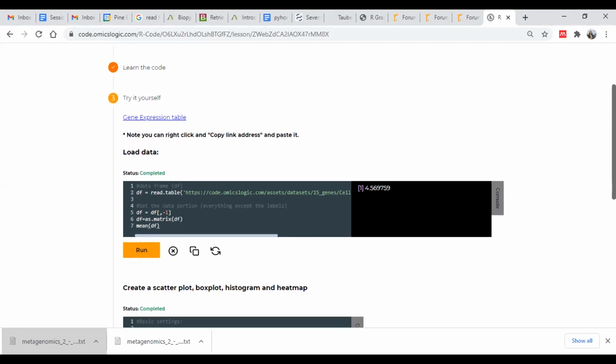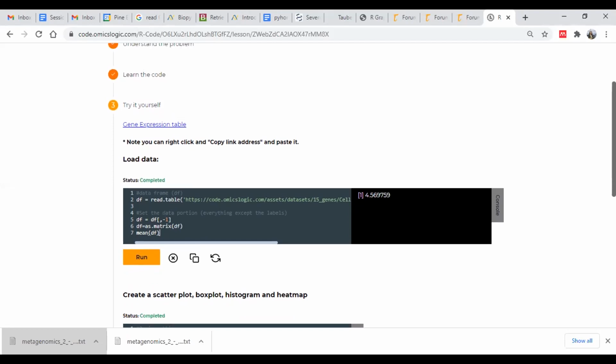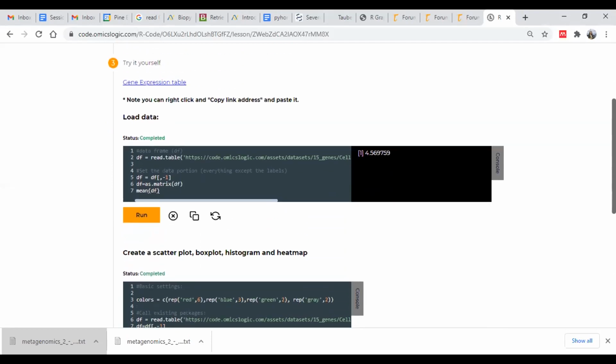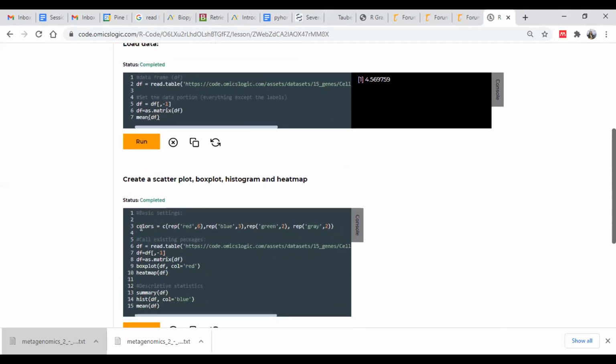Another question that Lydia has, which I have tried to address. So Lydia, is it clear to you why these colors are there and what they are representing? You can type yes or no in the chat box as well. Although we are not using this particular command in this code, let me again address what it represents.